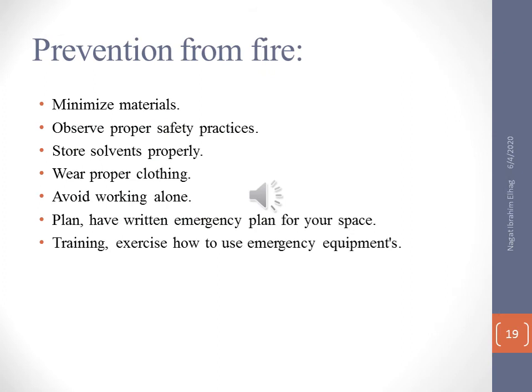From all mentioned above, we know that there are many hazards and many chemicals in your lab, so you have to avoid the risk and hazards. One of those risks is fire, which can occur from time to time in the labs, so you have to follow these steps to avoid any fire in your lab by minimizing materials.